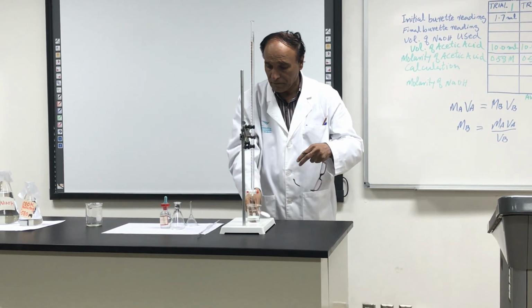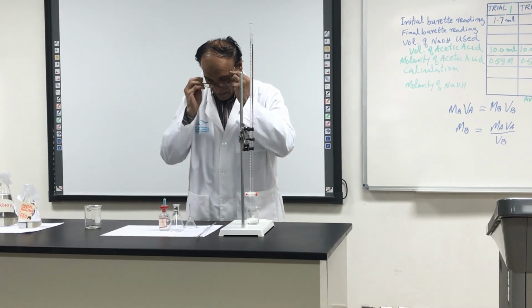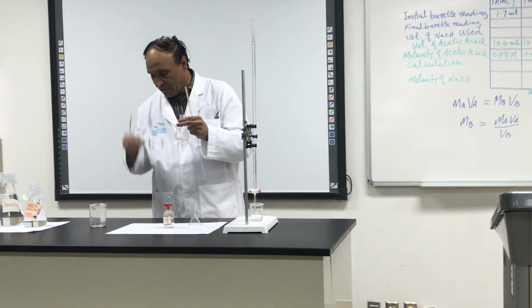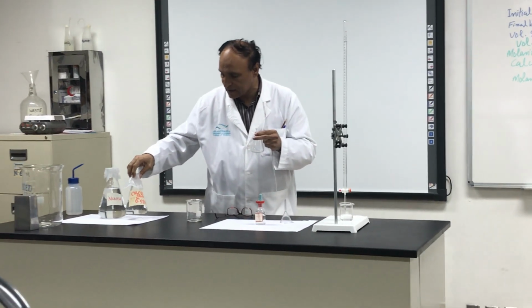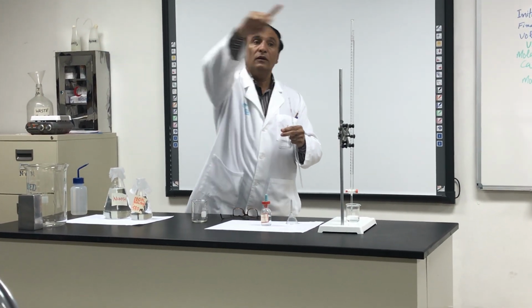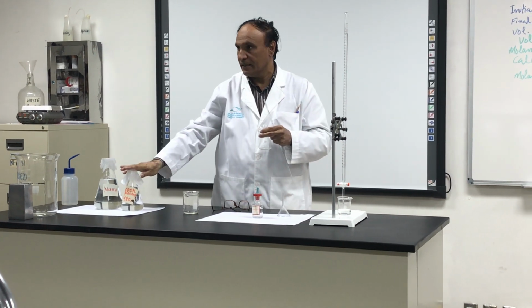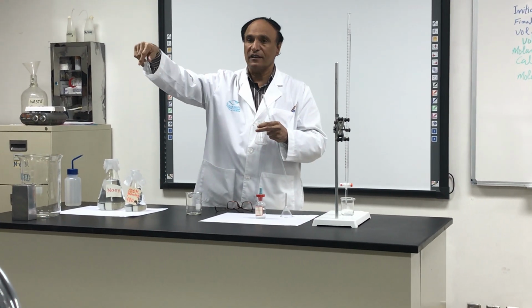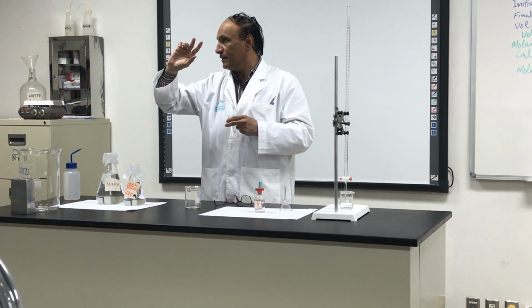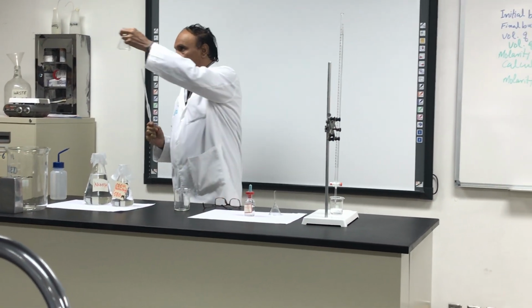Now the other student will take these things, this one and this one, with him, and I will put this vinegar, this acetic acid, in 4 places, 1, 2, 3 and 4. Any place which is free or where there are fewer boys, you go there. The second student will go there and take this thing and this thing with him.